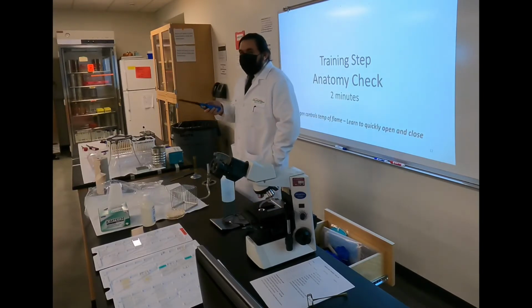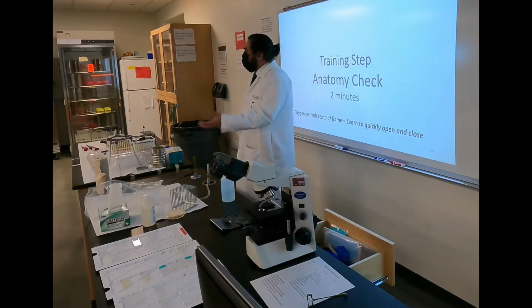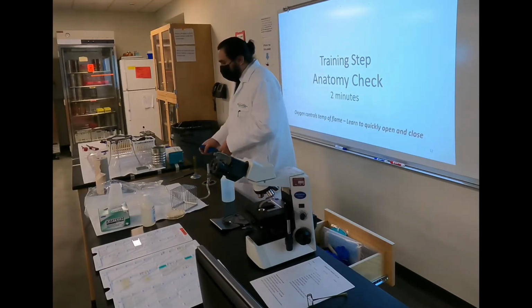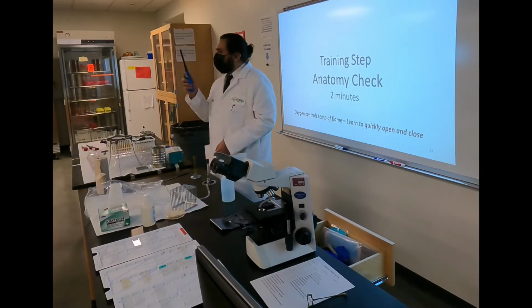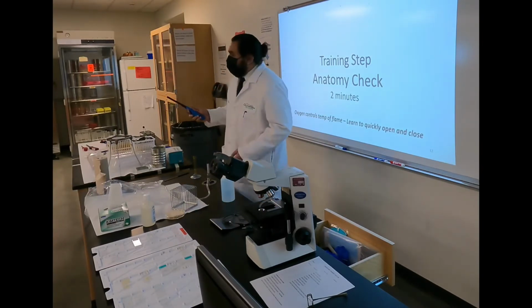Why do I say this? Because if you're doing this all the time, you'll have gas accumulating, and you're going to have an awesome fireball. It's my favorite thing to do in the lab. I'm going to show it to you too. The idea is to get yourself used to controlling your burner so that it's reliable, not get a new one, right?